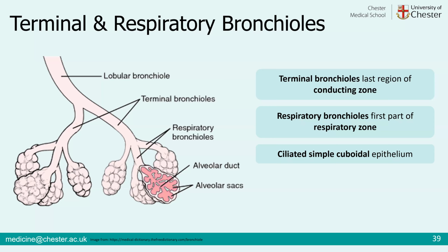But when we get to the alveoli in a moment, we'll see them transition again into a different type of epithelium. Because we've seen a reduction in goblet cells, we've moved away from that respiratory type epithelium. We don't have goblet cells anymore. This is then, I don't know why I've called it Clara there. I should have changed that.